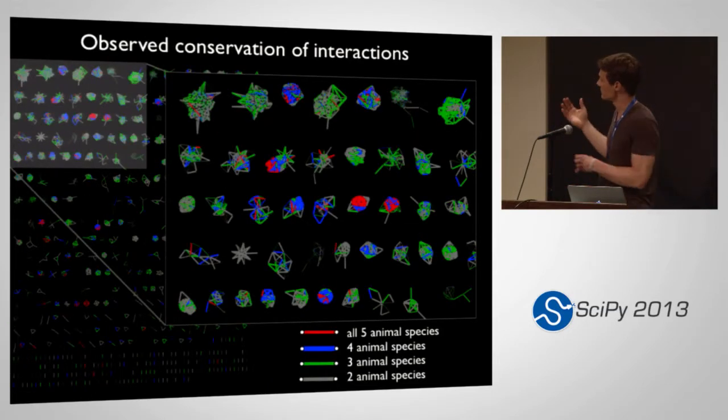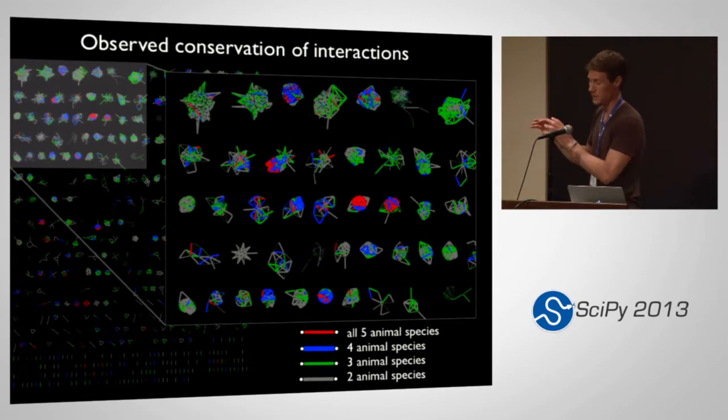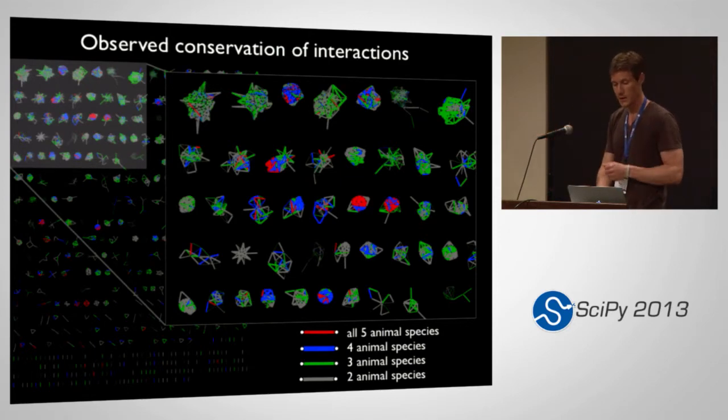As I mentioned before, we can use this data from multiple species to try to get at evolutionary differences in these complexes and conservation of different interactions. So here I've just visualized that even within some complexes, we have portions of the complex where the interactions are supported by data from all of these five species. In other words, we're seeing those proteins separate together in all five species. And then in some other portions of the complex, we're only seeing those proteins separate together in a couple of the species. So it suggests it could be a divergence evolutionarily, and we're looking at how to get at that better and really draw the line there in terms of what's actually diverged.